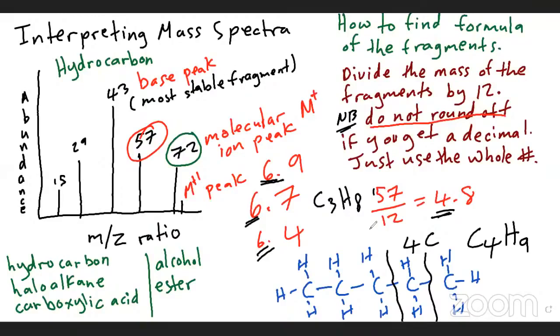All right, so to quickly get it once it's 4 carbons, you just do it like the alkane, but it should have one less hydrogen. All right, and that's it. And I'm going to do 43 now. I'm going to erase the top right hand side of the board.